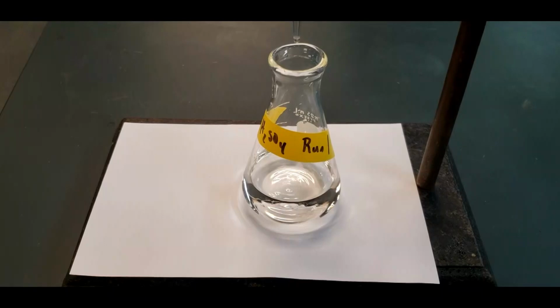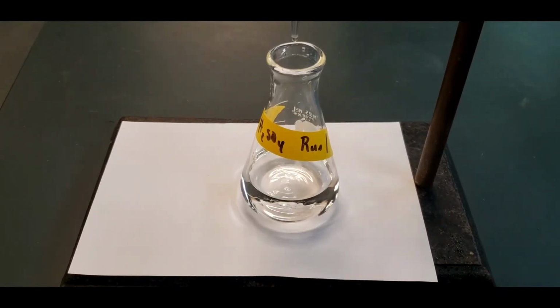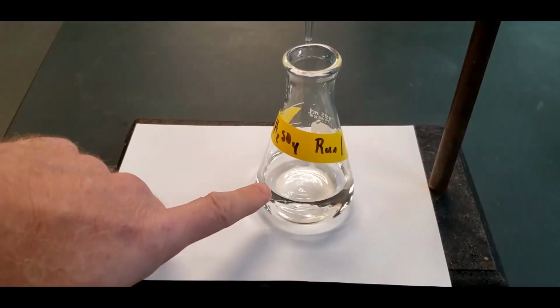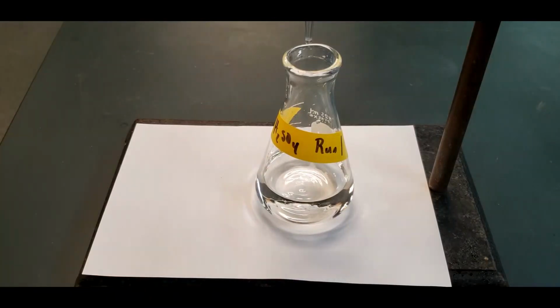So this is the first run for the sulfuric acid titration. You may notice the label looks a little bit different, and if my shirt shows up, you'll see it's a different color shirt. This is a different day. I just realized when I was about to start that I did not have enough time to finish all the titrations. So I'm back. Same solutions, just had to remake this sample. So this is the 10 mils of sulfuric acid, 50 mils of water, and then 5 drops of the indicator.